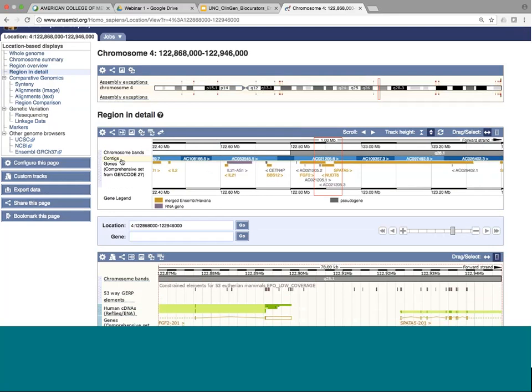So for example, here we have the contigs track. What we see here is this light and dark blue alternating blocks. This represents the contigs that make up the genome assembly. So you can see this blue bar running through the middle is the genome assembly. And then we have the genes track underneath. These colored boxes represent the individual genes, and you can see their names underneath as well. Again, we've got this red box, which denotes our region of interest.